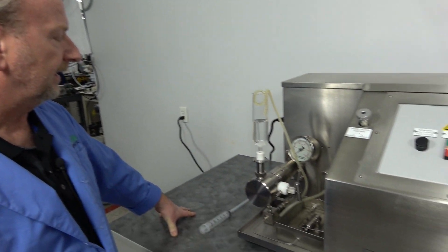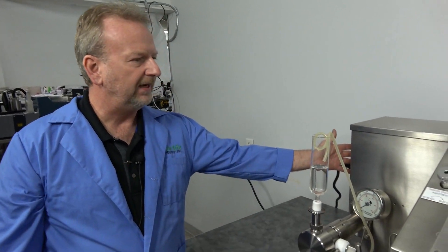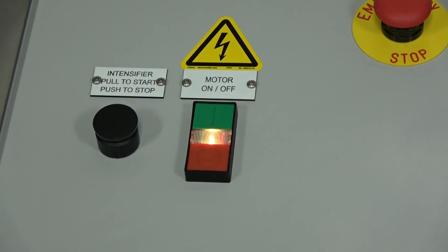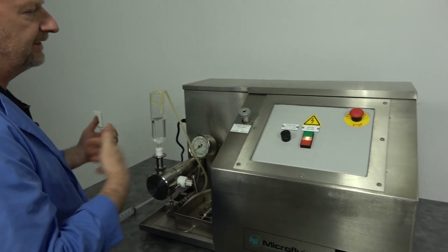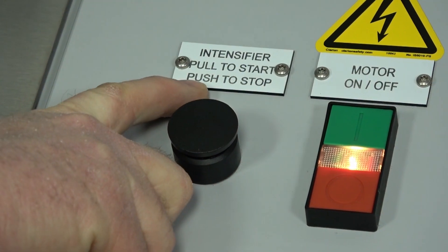We're going to go ahead and power it on. One thing this unit does put off is a little bit of noise because you've got a hydraulic system running, but in reality the noise level isn't any worse than the air models that we also sell. With the power on in back, you can see the light is on. First thing you want to do is turn the motor on — it's a little noisy — but we're not actually engaging the hydraulic system yet. That's what this lever here is for: it's the intensifier. You pull to start it and push to stop.